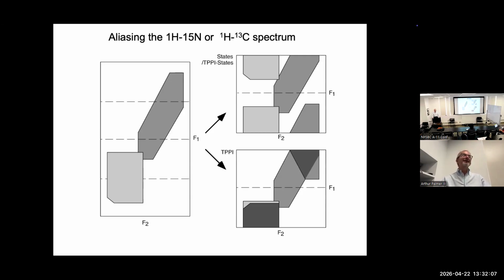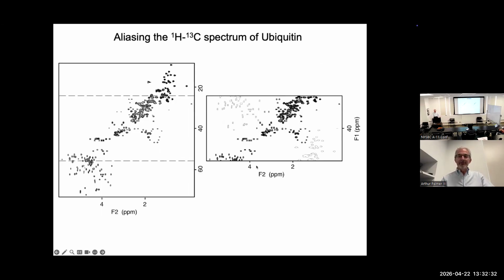Occasionally, you would find in the BMRB, the Biological Magnetic Resonance Bank, some deposition with just some crazy carbon shifts because the authors hadn't unwrapped the whole spectrum. You would end up with an alpha carbon at 10 parts per million because it was folded up here and hadn't been unwrapped by the authors. So I think that's pretty much all fit. But they were obvious problems. So here is an example.